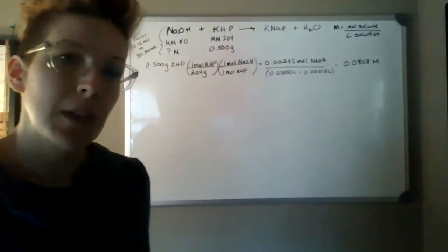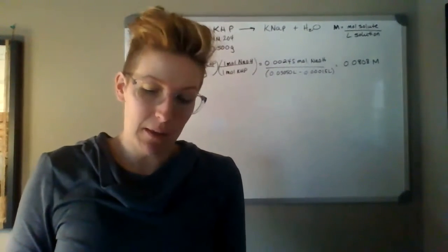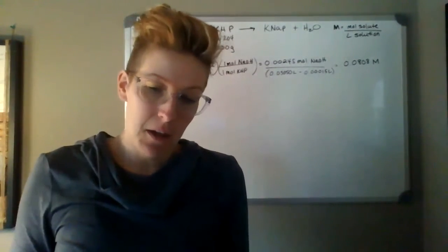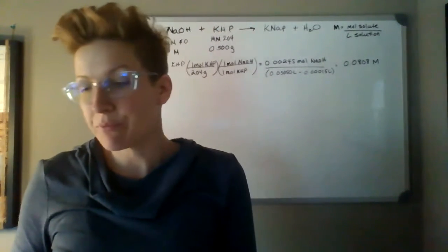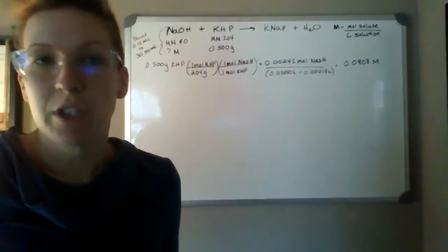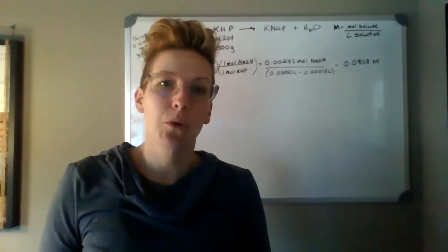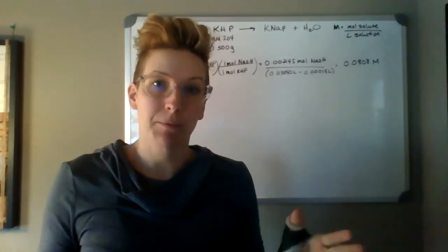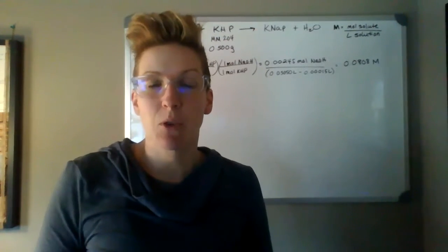All right, so this week is Lab 9, which is about titration. And I know we talked about this briefly in class. I think we might have done a problem as well. So a titration is a method to find an unknown concentration of something. The most common ones are acid-base titrations, and that's what this lab is going to cover.